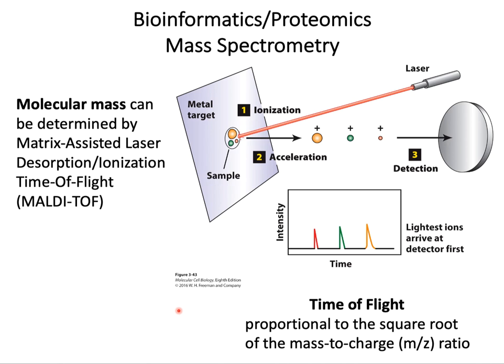We want to define what is known as the mitochondrial proteome, every protein in those mitochondria. You can do this by mass spectrometry. This is a diagram that shows the principle of mass spec. How it works is that you have a sample that you are trying to characterize, and the sample is absorbed onto a metal target. Pulses of light from a laser will ionize the proteins and peptides in the mixture. They become charged. There is an electric field in the analyzer that accelerates the particles towards a detector. All particles will move at different rates.